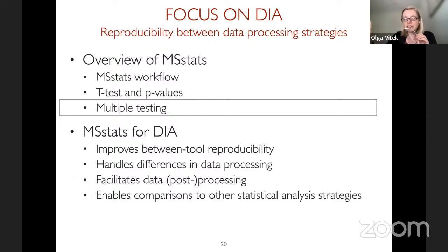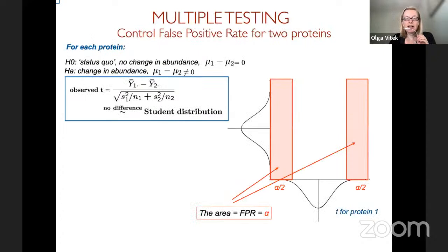Of course, all of those error rates accumulate, but the state of the art currently is to separately control FDR at the identification stage and separately control FDR at the quantification stage. There have been methods attempting to combine that, and I think there is value in that. The problem is that computationally these problems become very difficult to scale to large data sets and to complex designs. So for the moment, the default strategy in most experiments is to separately control FDR at the identification and quantification stages.